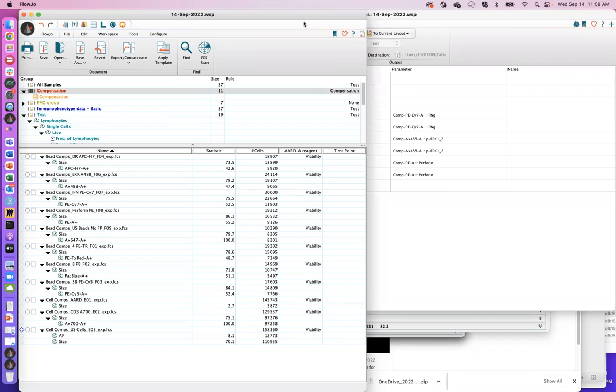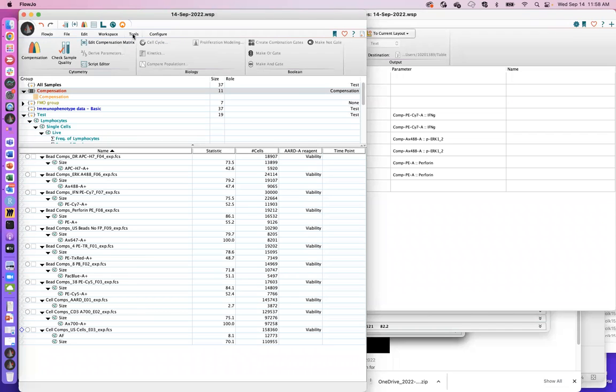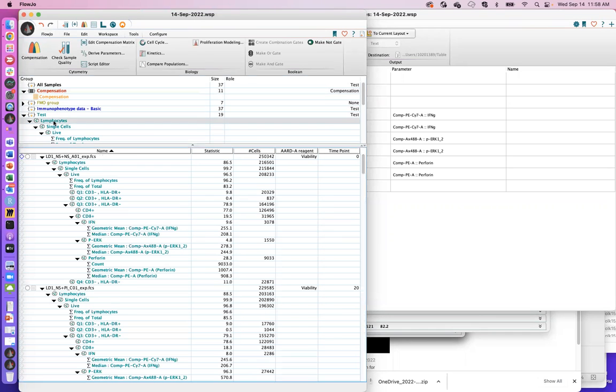Hey, I'm good. I just wanted to ask if you could briefly pop into the cell cycle platforms. There is one person that may be on the list today and joining us, or may check the recording, but was interested in looking at cell cycle measurements and S phase detection.